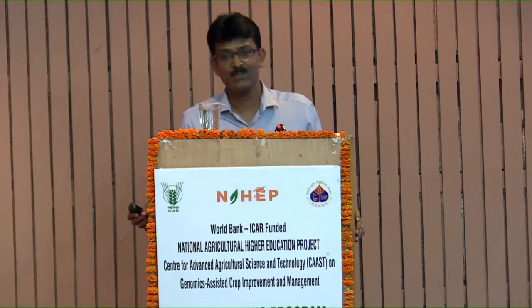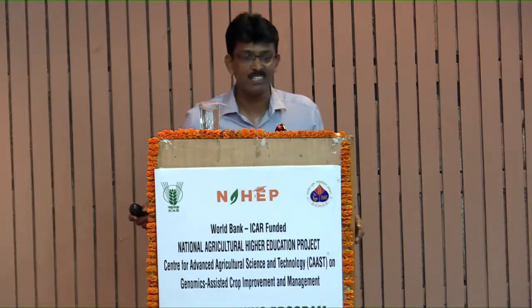That is the reason why SYBR Green is famous, because we have better online platforms to design primers, and those primers are really working wonderfully well. So people are comfortable with the so-called SYBR Green. The reason is that primer designing is not a big deal nowadays. We have a number of platforms available online, and formulas have been devised to arrive at an annealing temperature which is going to amplify only the target.